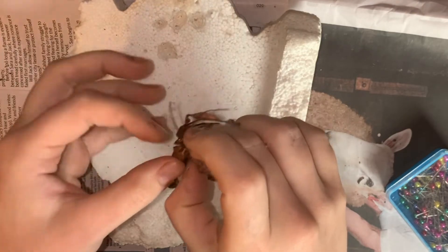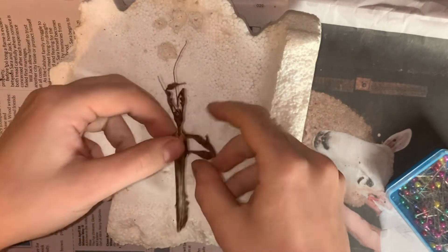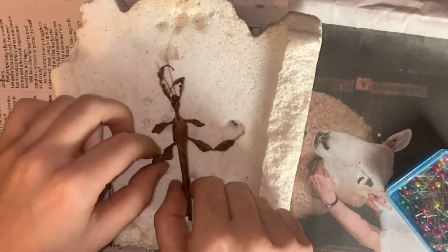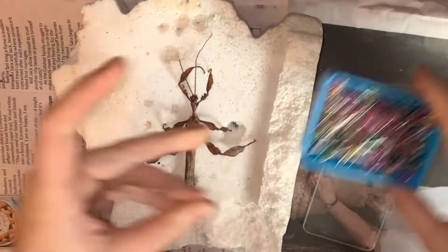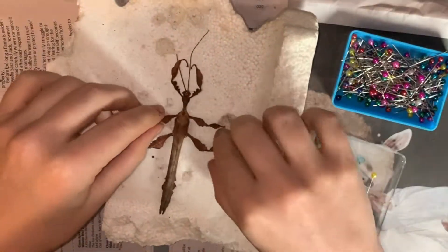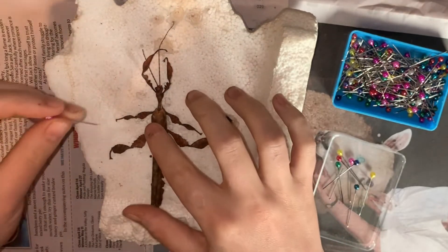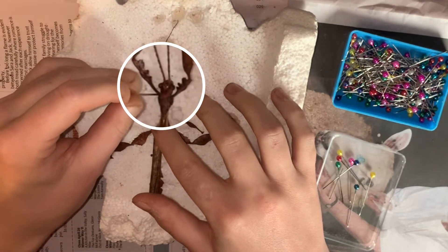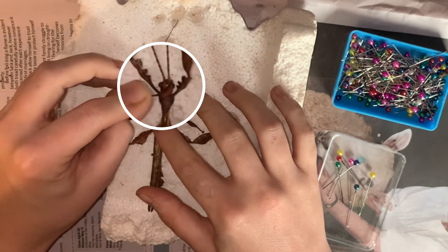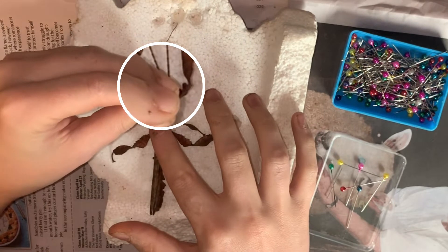Start by carefully uncurling all the limbs roughly into position. Then add one pin on both sides of the head. It's important to remember that no pins should be pierced into the actual insect — the pins are to be placed around the specimen, not in it.